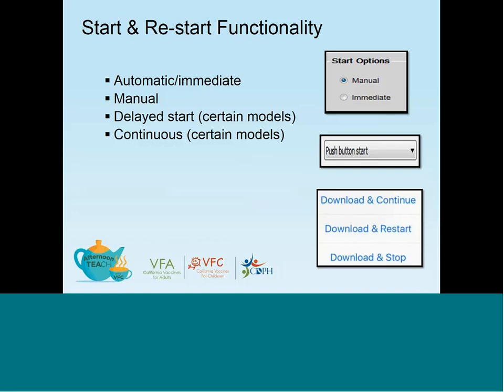Considerations to keep in mind: the distance from the vaccine storage unit to the locations for downloading data, staffing, and your clinic flow.